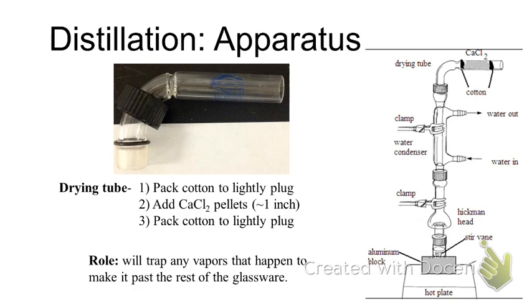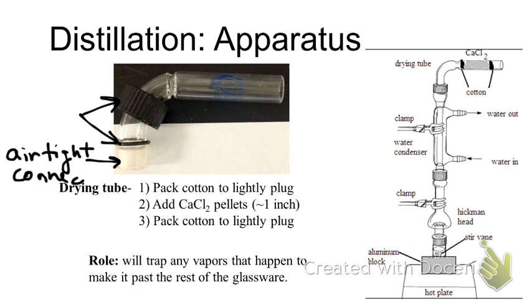This one provides the best image of the cap assembly, which absolutely has to be put together properly. You've got the ground glass joint, and then you've got the rubber O-ring and the screw cap. What's the point of the ground glass joint? What's that? So you can make a hard seal? Yeah. The ground glass joint makes your airtight connection. It prevents liquids from coming in, it prevents air from coming in. It's nice, it keeps that set up.